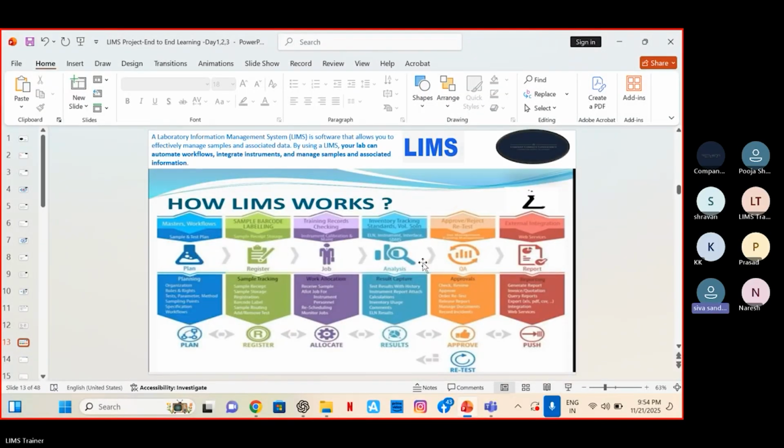Hi. You told if the application is hosted in a system, we are deploying the LIMS agent. For simple instruments like balances, how will we capture the data directly to LIMS? Right. Okay, so the interface will happen between the instrument and the LIMS.